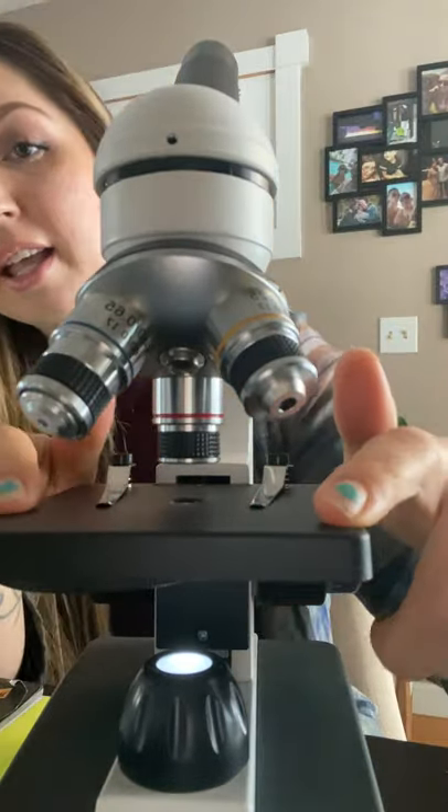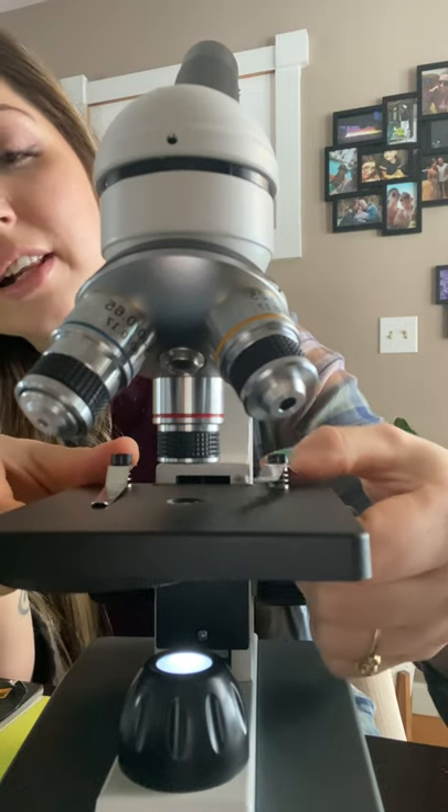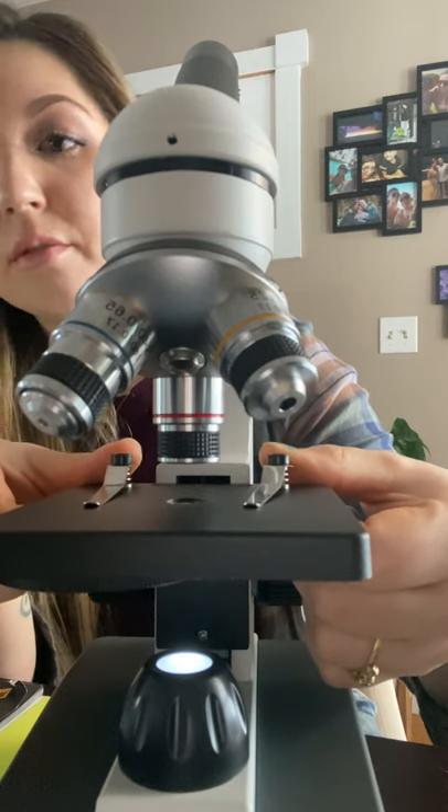This right here is the mechanical stage. This is what your slide is going to go on, and these are the slide clips that we're going to lift up to place the slide on when it's time to do so.